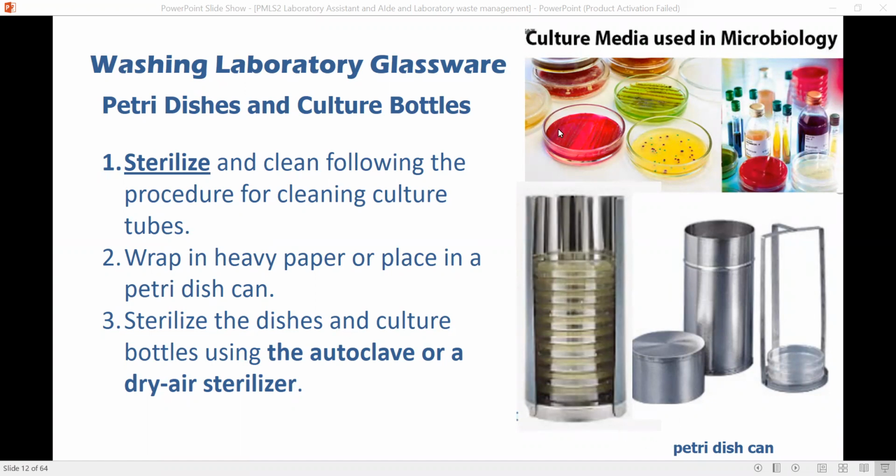Now, for using this, of course, yung mga ginagamit natin sa microbiology, bago tayo mag-culture, we use this for culture, ini-sterilize mo na yan. So, ang sterilization is before washing, and then after washing, before using. Para talagang malinis, walang microorganisms present. So the microorganisms that will grow on this culture will just be the microorganisms coming from the specimen of the patient. So walang from outside source.